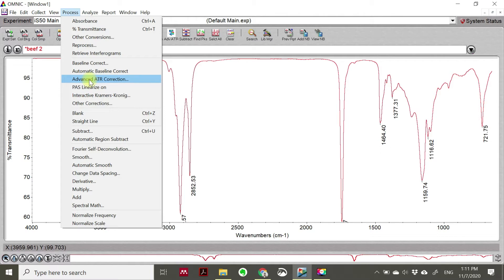Generally with this ATR feature, you don't have to do any sample preparation. You just put your sample in liquid form or in solid form on the ATR and then perform the analysis - just click the FTIR and you get this result. Since we are using the ATR correction, and most FTIR software uses the principle from transmission, we need to do a correction.